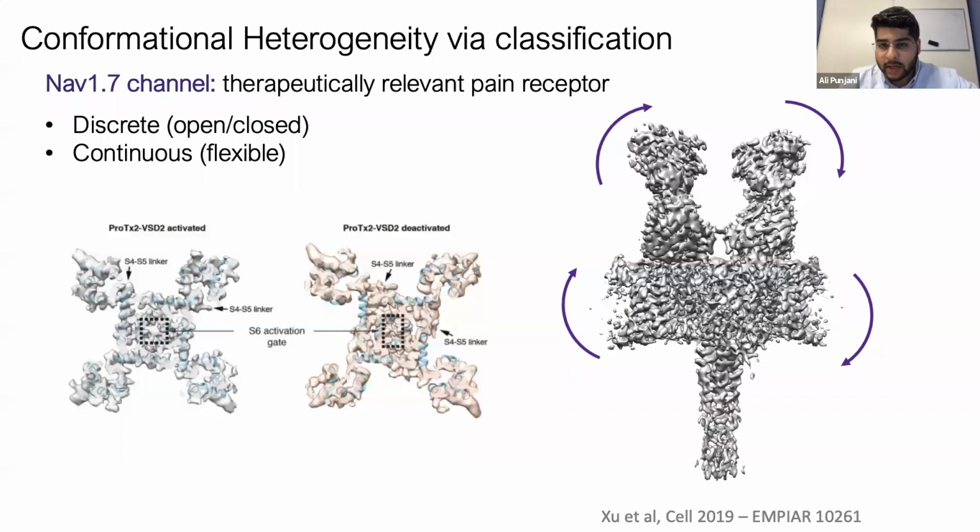But you shouldn't try, just like in this case, it wouldn't be right to try and guess what is the pathway of motion between the active and deactive state, because we don't really see particles in between that.